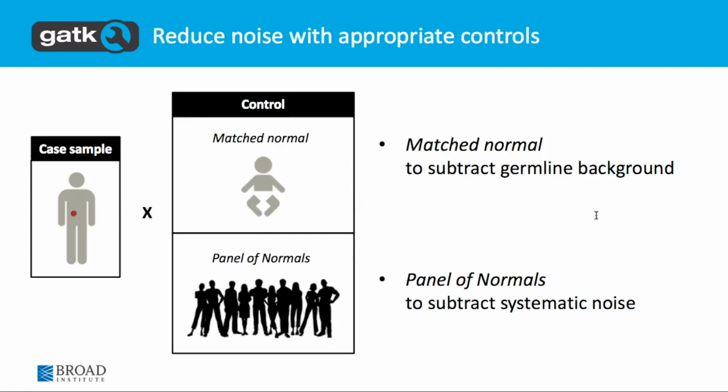And it's the same name for a lot of different things. In somatic SNV and indel calling it means one thing, and in copy number variation, it's a slightly different thing. It has the same name though.